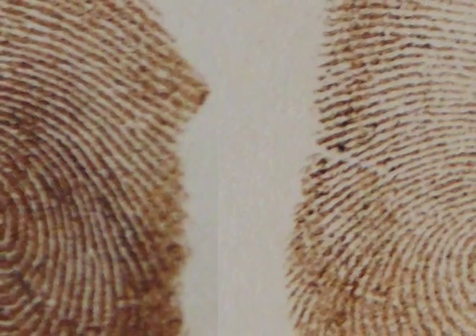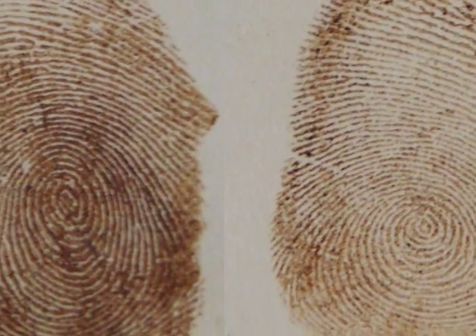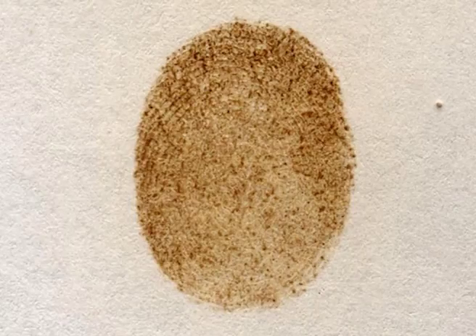Initially, it was believed that iodine can be added chemically and reversibly to double bonds of the unsaturated fatty acids present in the fingerprint residue. However, it was later suggested that the mechanism of the reaction involved physical absorption of iodine on the fatty acid content. The iodine fatty acid interaction imparts a yellowish brown color to the ridge pattern. Iodine fuming is a simple procedure of developing latent fingerprints. A sample fingerprint developed by iodine fuming method has been shown on your screen.